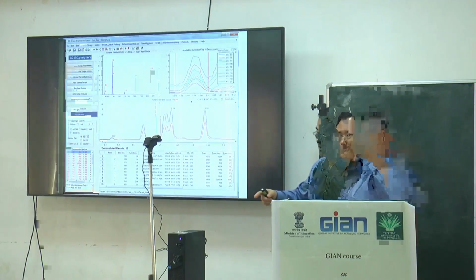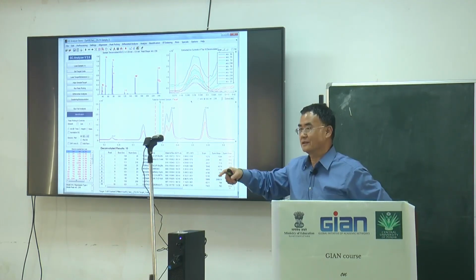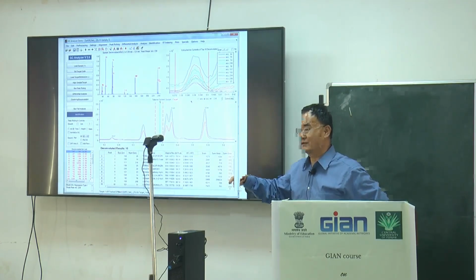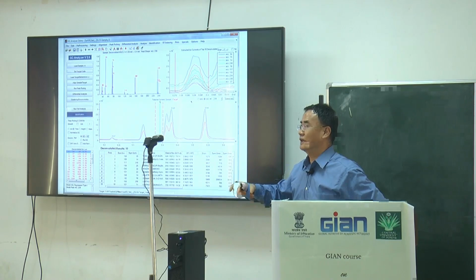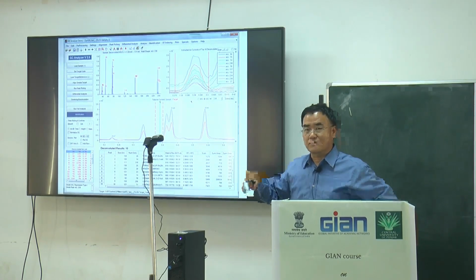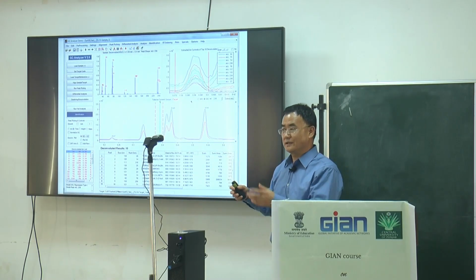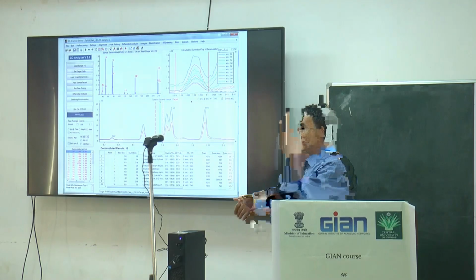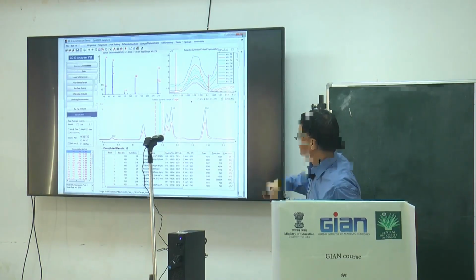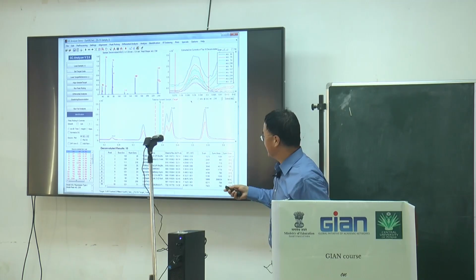But if you use the ammonium or other additives, they will make the column properties suited for a specific purpose of isolation.